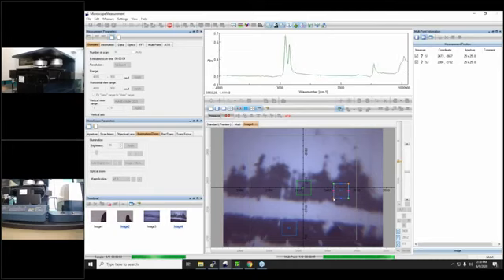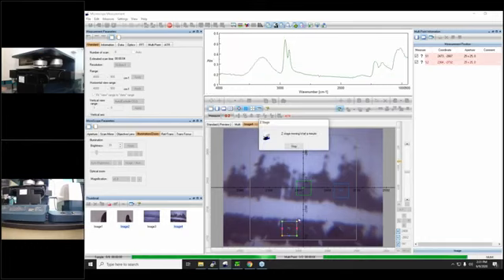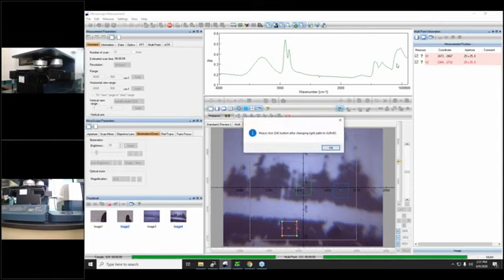The first sample is in this location, it's S1, and this is our signature of the FTIR spectrum. This is the second location. The second location was already taken, and we finish our measurement of different locations using the ATR crystal.